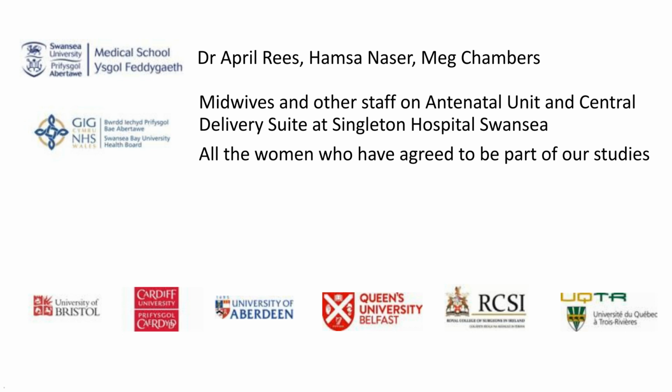Yeah, my tip is to just be religious in your approach to following the protocol. I can give you an example of many years ago when in the laboratory I worked in prior to moving to Swansea, I had a student who was bemoaning the fact that their MACS separation wasn't working. I sat with them one day and they were doing something as simple as, it's meant to go in the fridge, but they were putting it on ice. And so that changes the temperature that everything was being done at. And when they went back and followed the protocol faithfully, then everything worked particularly well. So that's my main advice, is to be faithful to the protocol.